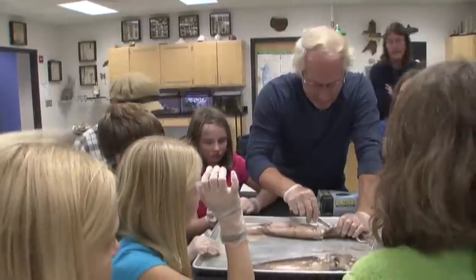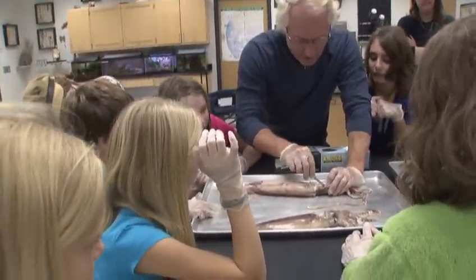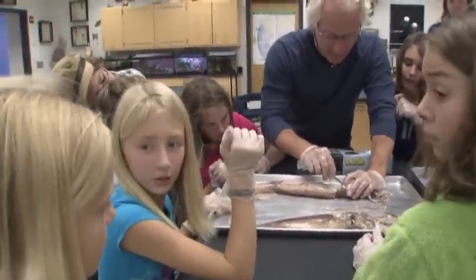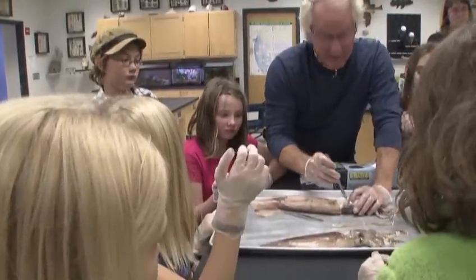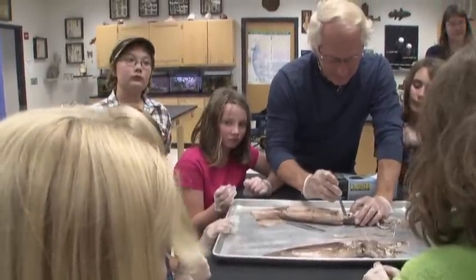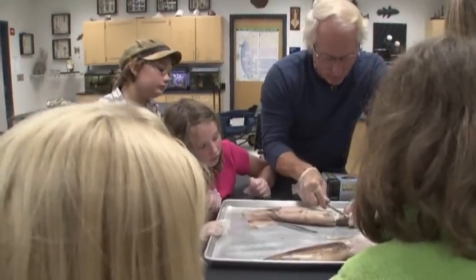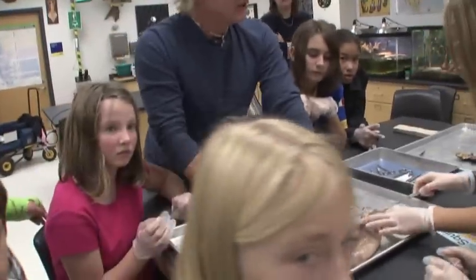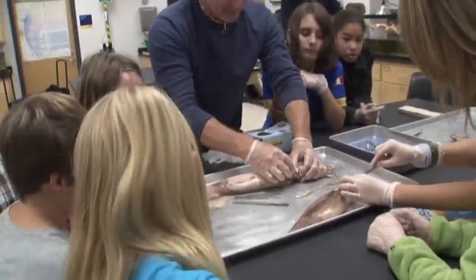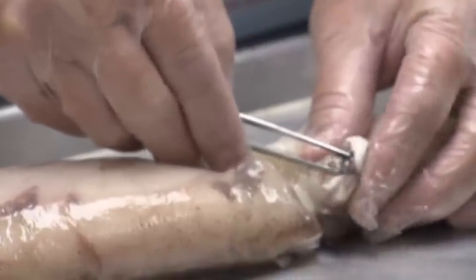Now, I know we're running out of time here, so I didn't mean to actually do that, but I'm going to pull this eye out. Look how big this eye is. This is huge. This is like our eye. It's got a retina back here. This eyeball is enormous. This is the biggest eye for its size, even bigger than a whale's eye for its mass. So here's the lens. You see it right there? We're going to take the lens. Watch, that's a little out. You have to be careful because they squirt.